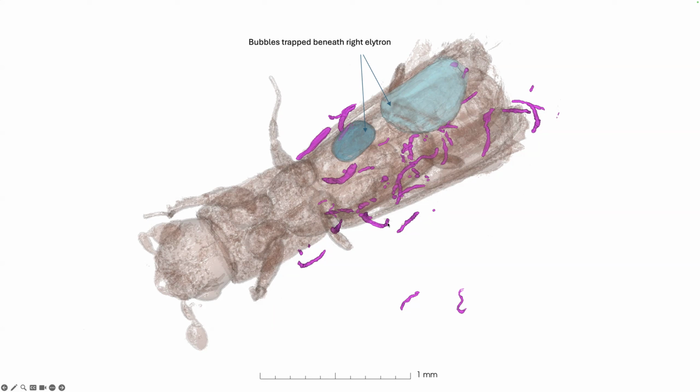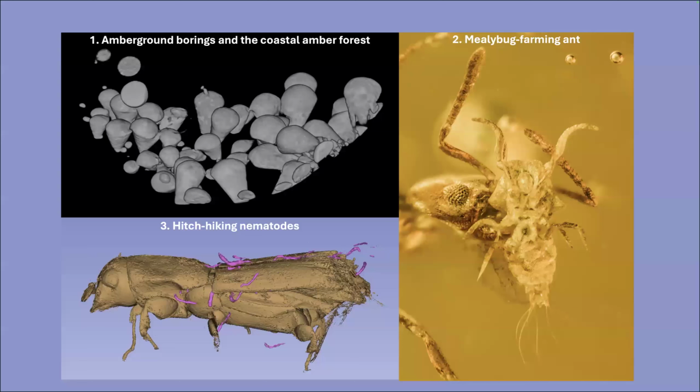So I took measurements, and you end up saying, one of the nematodes managed to reach 800 microns away from the beetle. And you look at the picture and you think it's very, very dramatic because they've hit the resin, and the little nematodes go swimming for their lives. Swim, little nematodes, swim. None of them made it. So all on a scale of less than a millimeter.